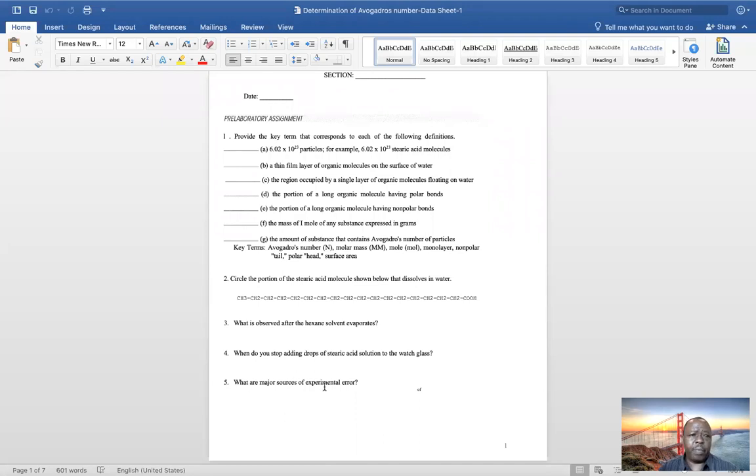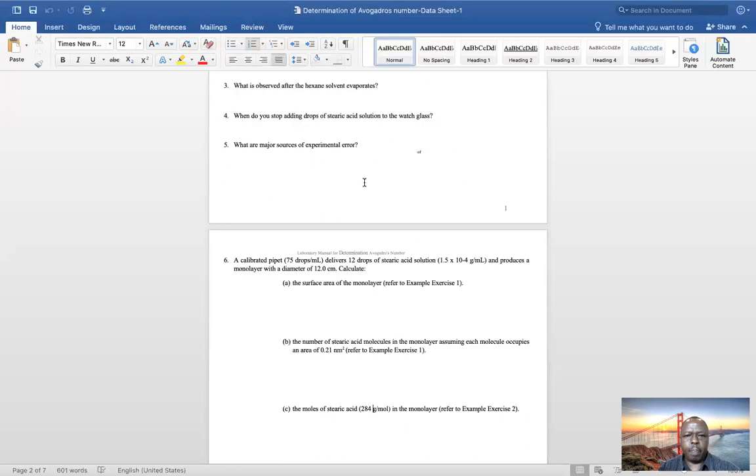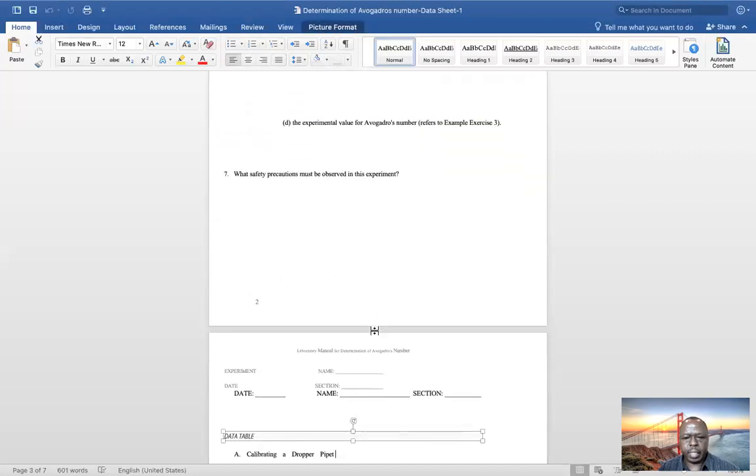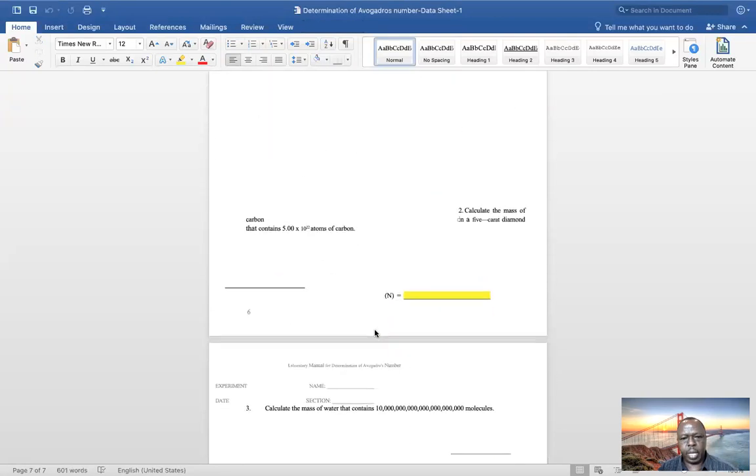To answer question 5, there is a YouTube video, about 7 minutes, which I recommend you watch. It's still on determination of Avogadro number. You can watch at your own convenient time. Somebody in there mentioned possible errors you may encounter in this experiment. The worked example will help you on how to proceed with this, and there is the pre-lab. This is the data sheet, what you are seeing right now. This is the data sheet which I went through.